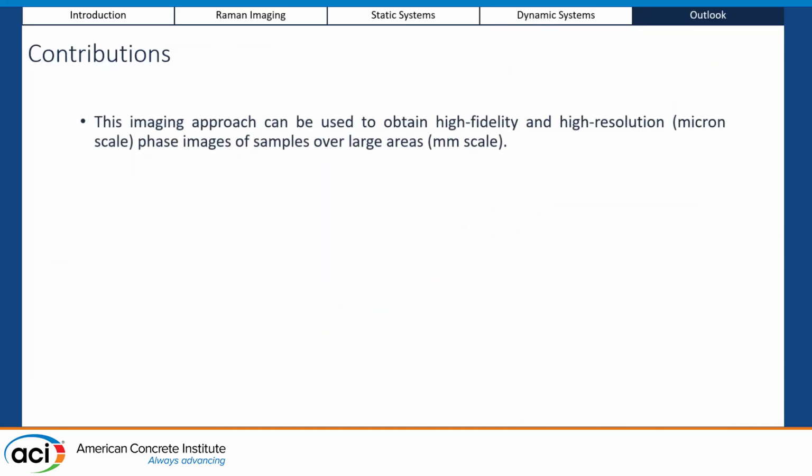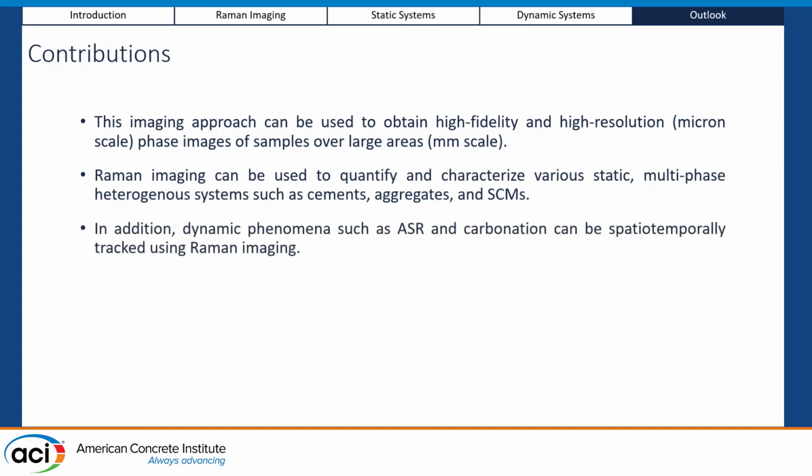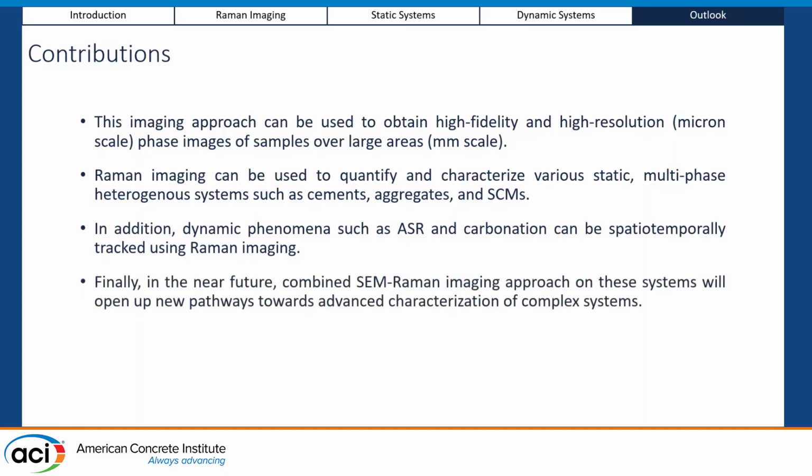Okay, so if I were to summarize the different contributions here, this imaging approach, you can use it to obtain very high fidelity, high resolution phase maps of samples over large areas. You can use it for a variety of systems, static, multiple phase, and so on. You can look at dynamic phenomena.